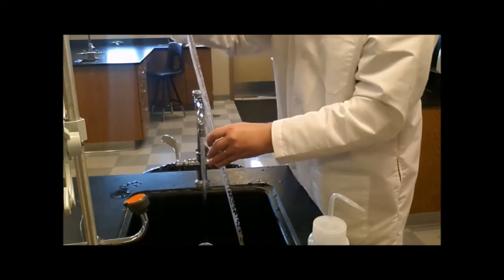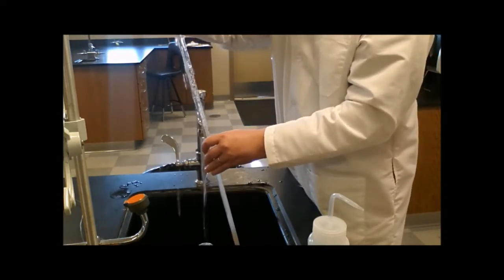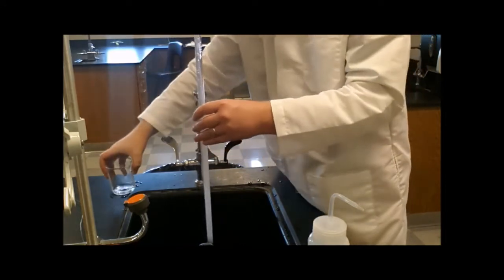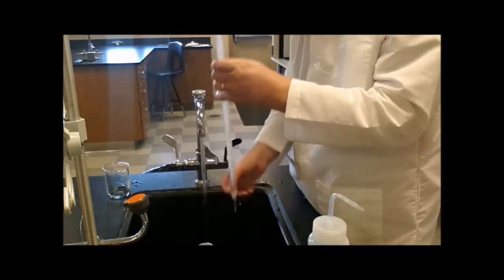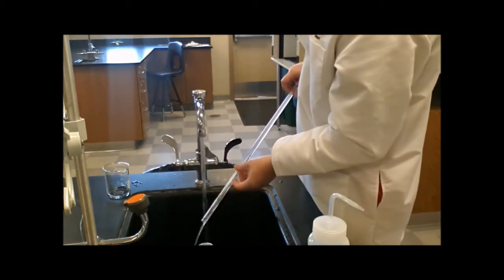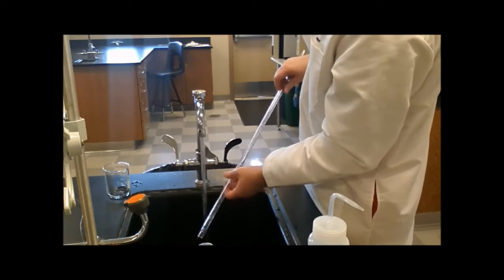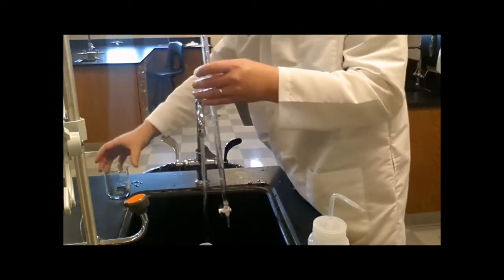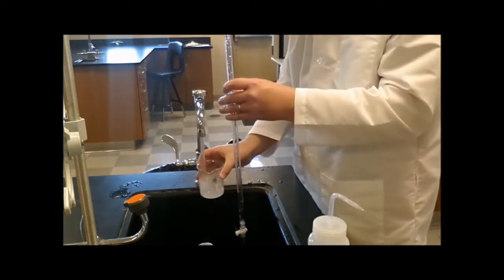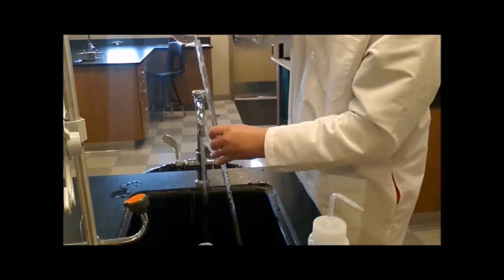This might take you a while. You might be at this for a little bit. But it's pretty important that you clean out your burette, because who used it before you and what was in here? You have no idea. So you want to make sure that you can get this nice and clean. But if you don't get all the suds out, then your titration is going to have soap in it, and that's not good either.